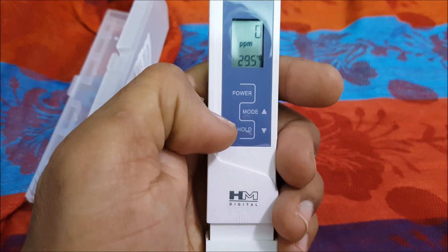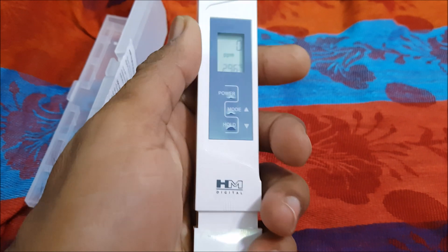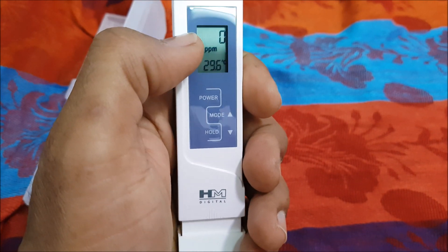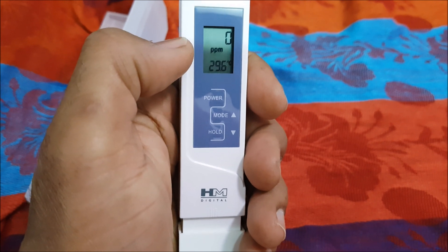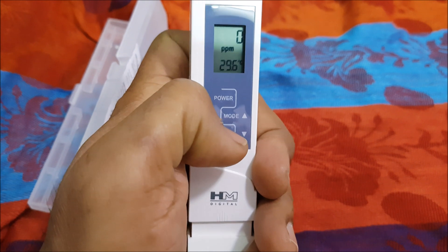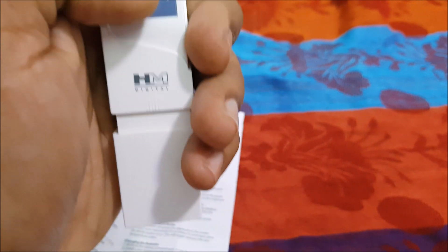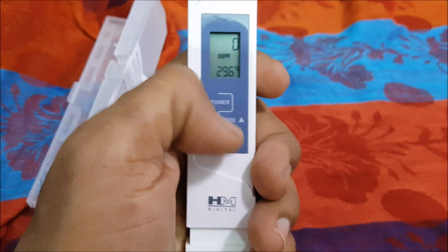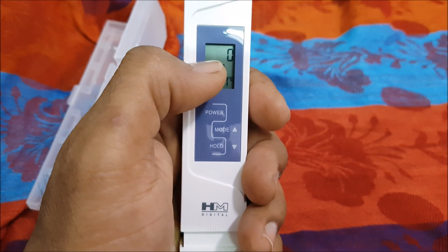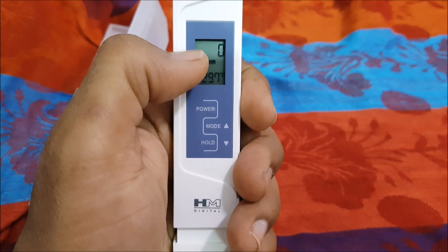Below that is the hold button. When you put the meter in water, after about 10 seconds — though I found it gives the correct TDS almost immediately — press the hold button and take the unit out. This freezes the display at whatever TDS value was shown when you pressed hold.